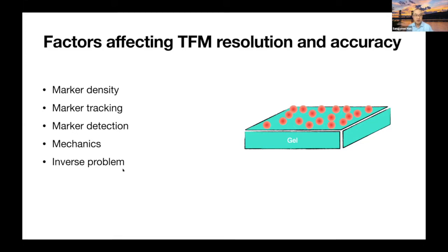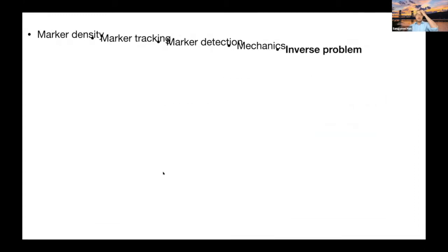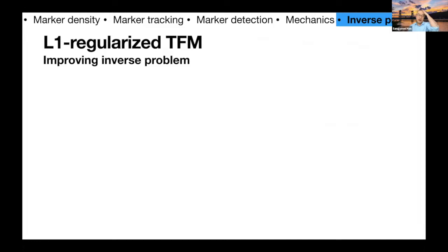I'm going to talk about only a few of them: the inverse problem and mechanics, and a little bit of tracking. But we are also working on other parts at the same time. My participation in the traction force microscopy world is by contributing to the inverse problem solution.